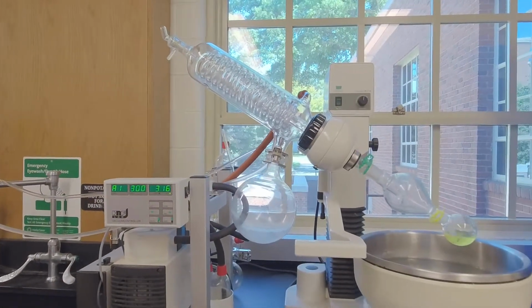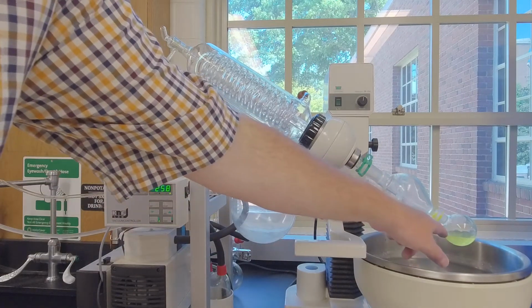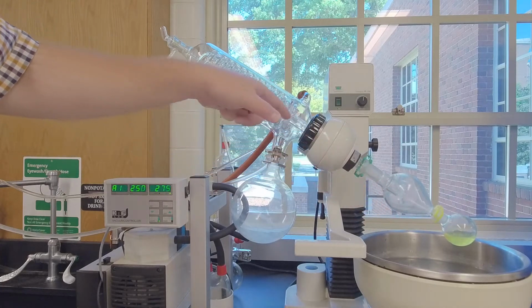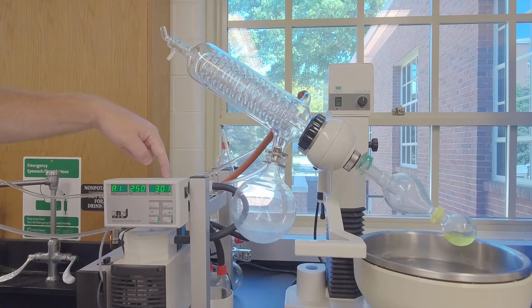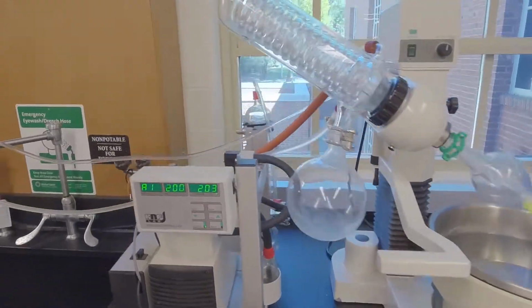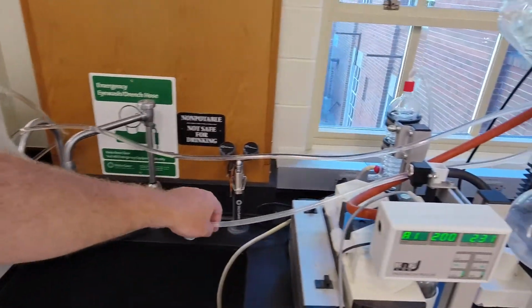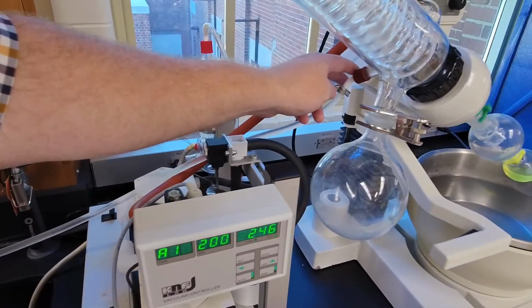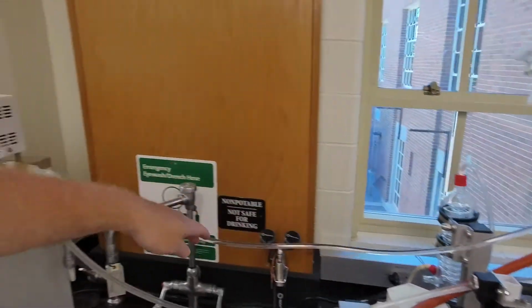All right, that's great, you say. Perfect, Dr. Jones. So the solvent's going to boil, be sucked up via the vacuum. Now, we don't want to suck the solvent into our pump, all right? This is kind of a delicate piece of machinery. It's expensive. So you see these coiled lines here? This runs to the cooler, all right? So this chiller is cooling liquid, antifreeze, running through here into the coil, through the coil, out, back to the chiller.